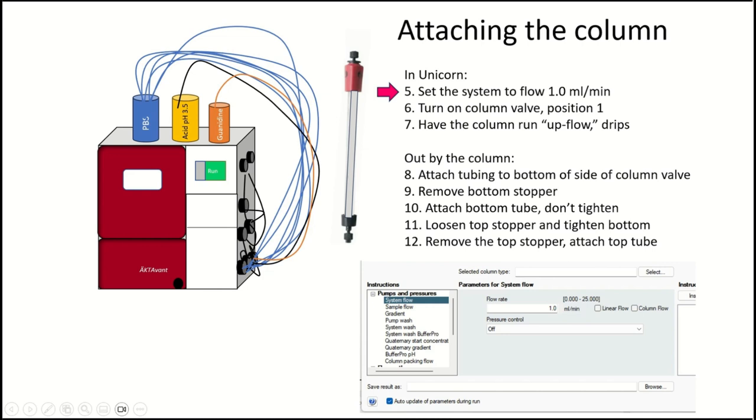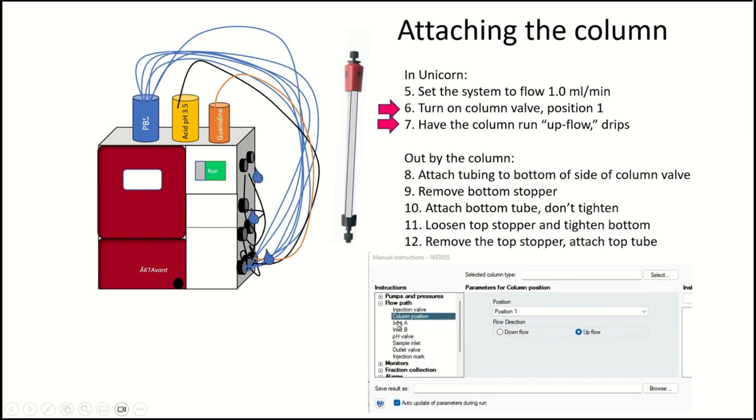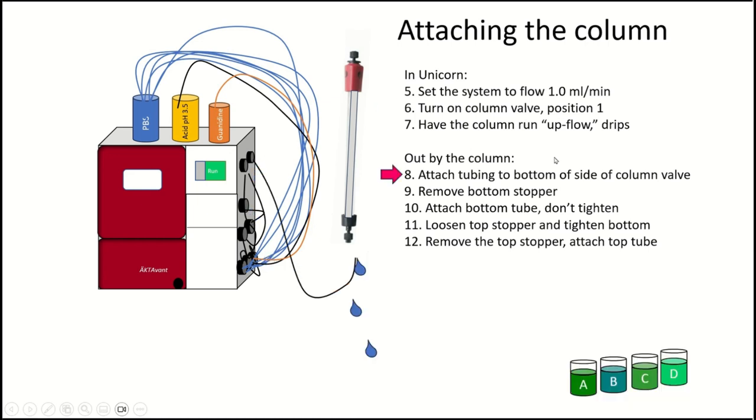Okay. So in order to attach the column, we are going to set the system up with a flow of one mil a minute and that's done right here. And then the next thing we're going to do is in unicorn, we're going to set the column position to position one. And then we're also going to set it for upflow right here. So that the system will start running up. Then what we're going to do, so now that it's running, we're going to get drips coming down off the side because there's not going to be any inlet tubing. Sorry. There's not going to be any tubing for the column at this point, right?